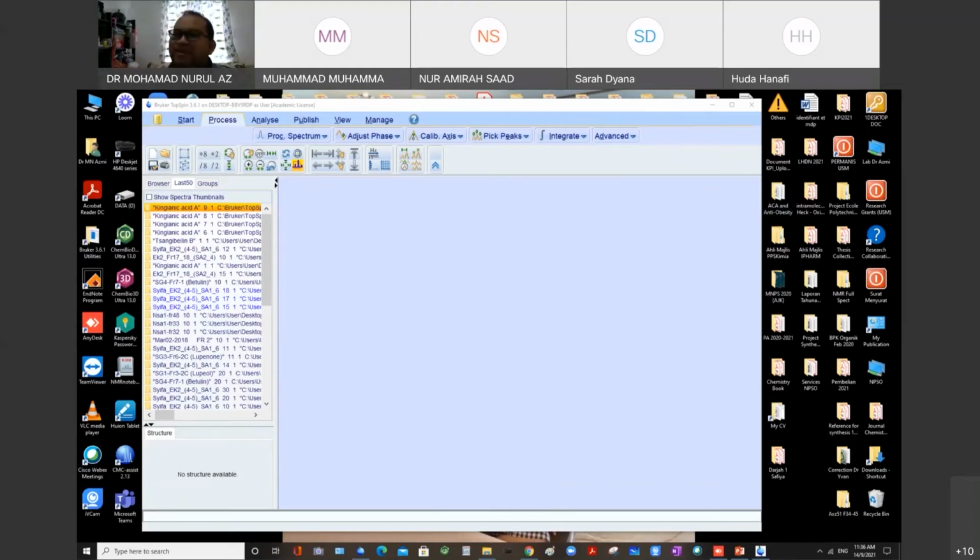I cannot imagine it unless I can see the NMR. So, is it okay if we discuss when you come back? Yes, okay, I am happy to discuss case by case.